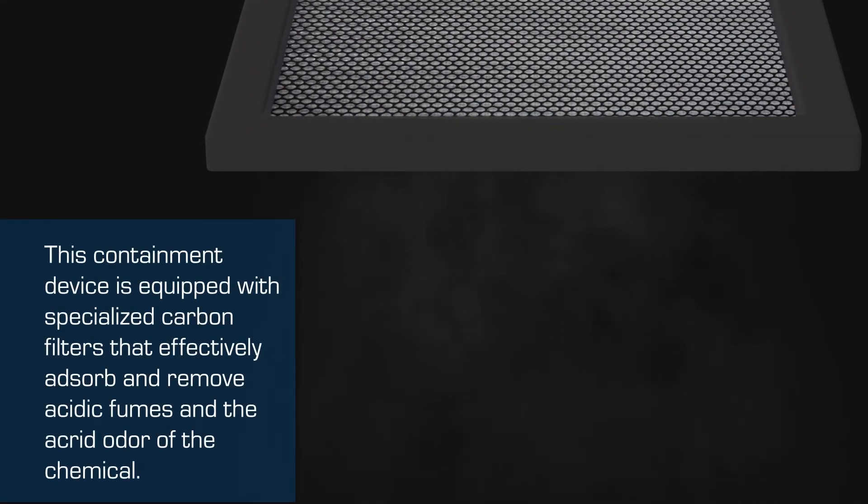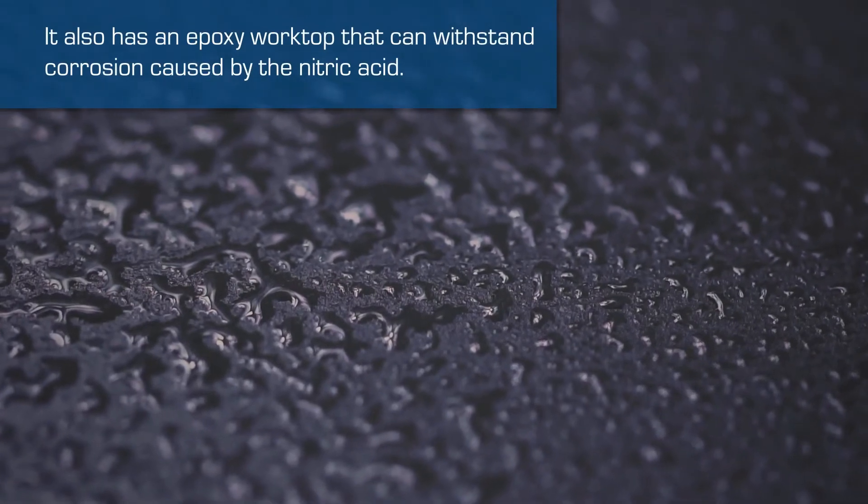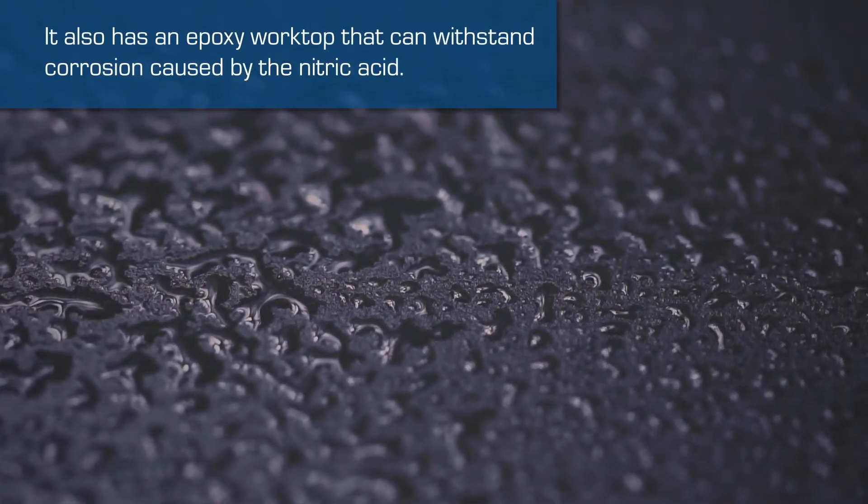The specialized carbon filters effectively adsorb and remove acidic fumes and the acrid odor of the chemical. It also has an epoxy worktop that can withstand corrosion caused by the nitric acid.